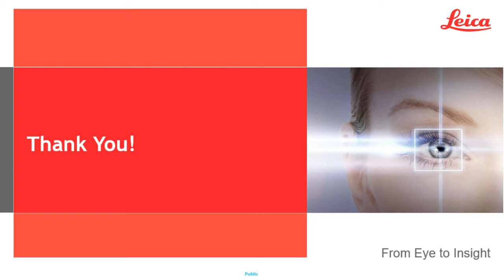And I highly suggest, as a starting point, use that machine learning piece to get started. And then if you're looking to move to deep learning, take a look around to see if anybody's already created a model that is what you're looking for. What you're trying to find is to match the images that you've already created to what they're using to train the model. And if it's a really good match, it's likely that you can use that pre-trained model so you don't have to train your own.